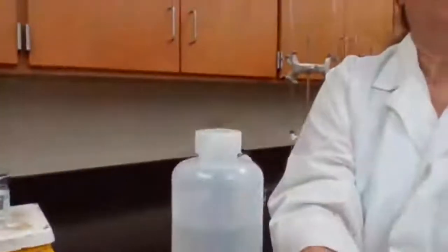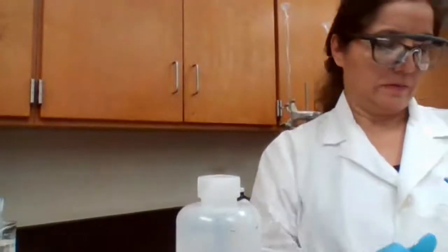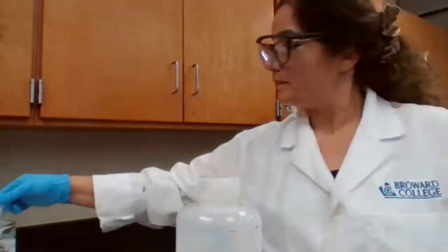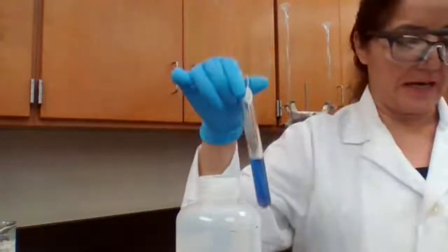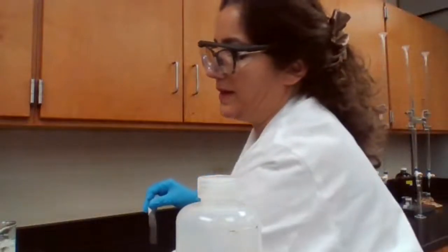Record your observation, please. Record your observation. This is after heating up in the hot water bath.